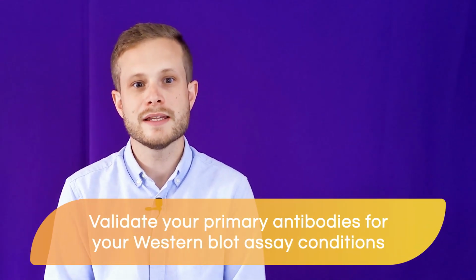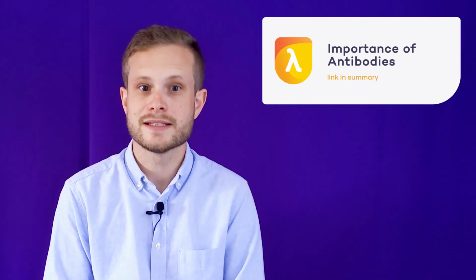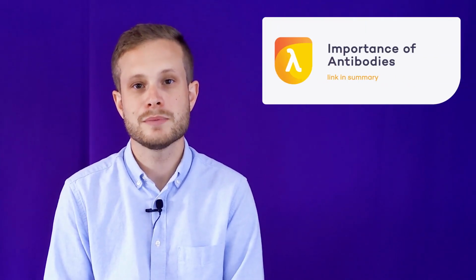When you have selected your primary antibodies from the various options out there, it is important to remember that you are not quite ready to use them in your research just yet. You also need to validate them for the particular conditions of your Western blot assay. For more information on how to select and validate antibodies, please refer to the Lambda U learning path on The Importance of Antibodies. Now we've discussed the importance of carefully selecting a primary antibody and the categories of antibody that you can choose from, let's move on to the protocol for the primary antibody incubation step.